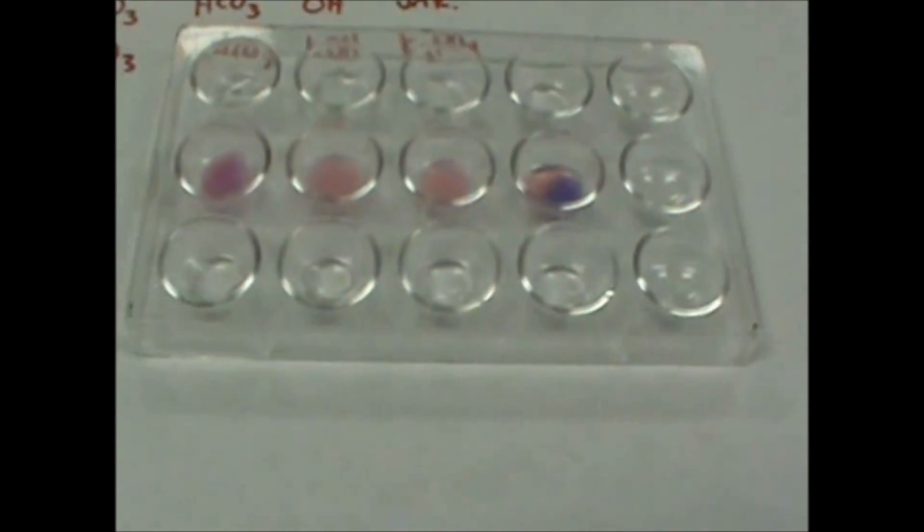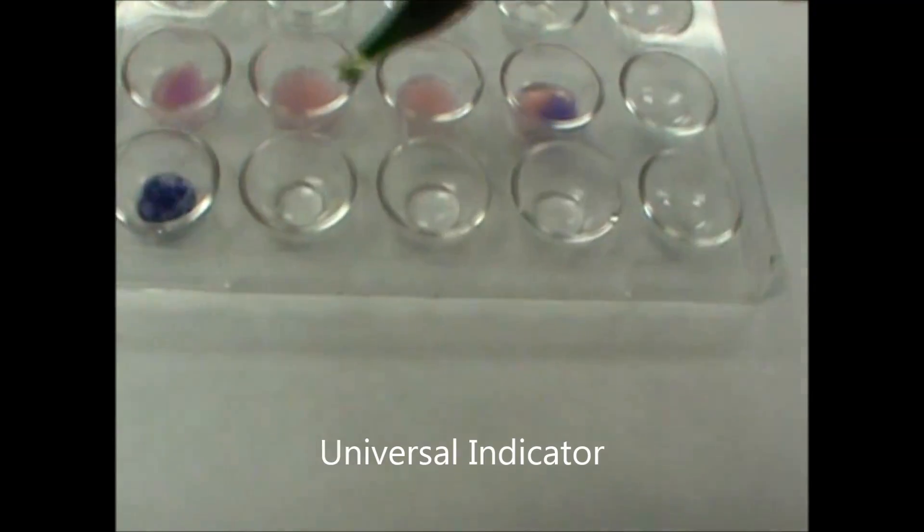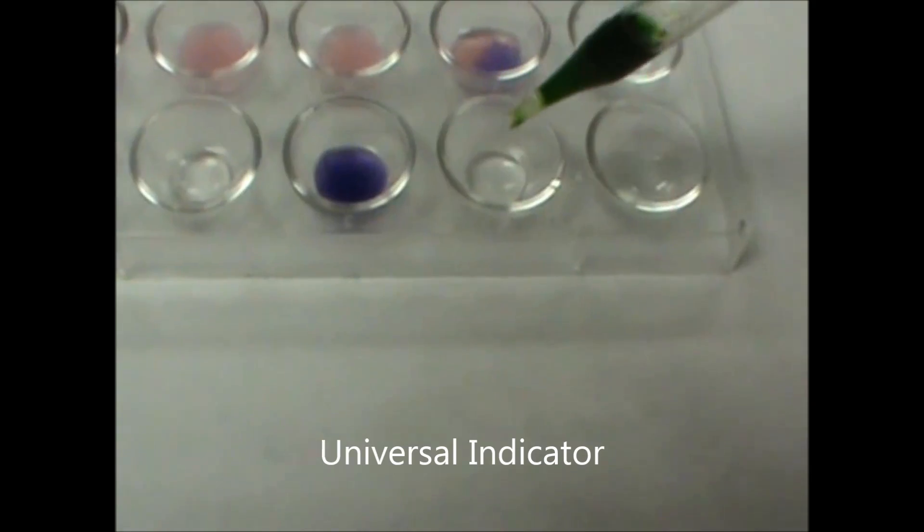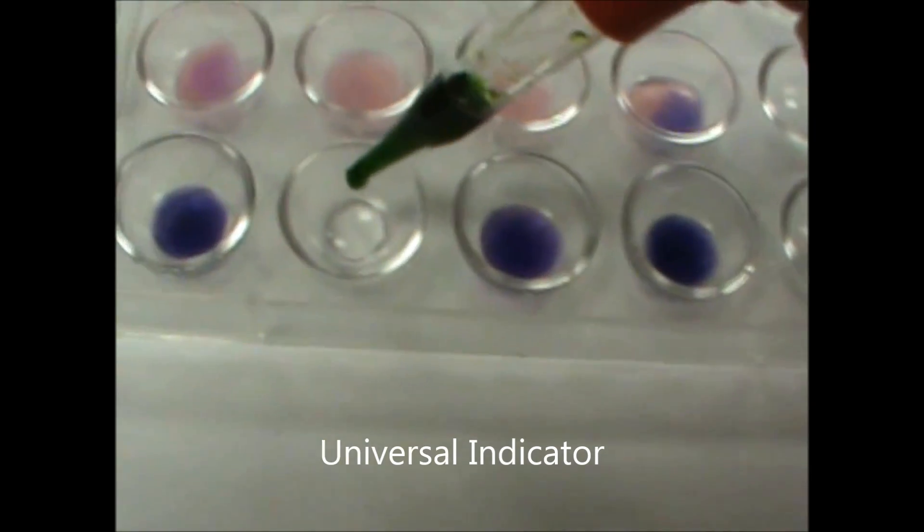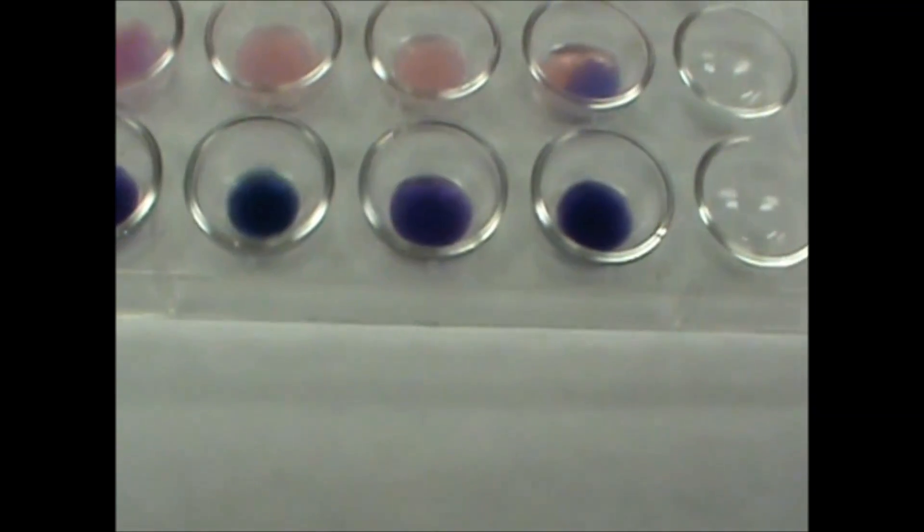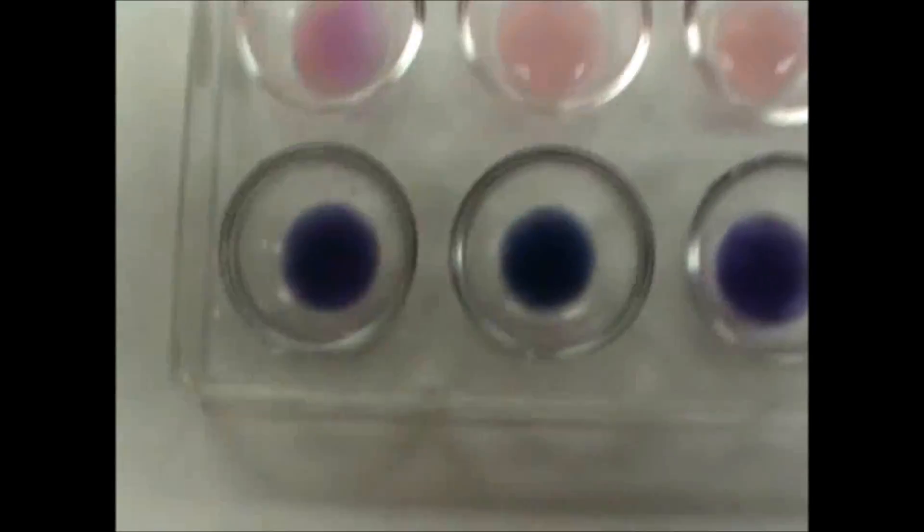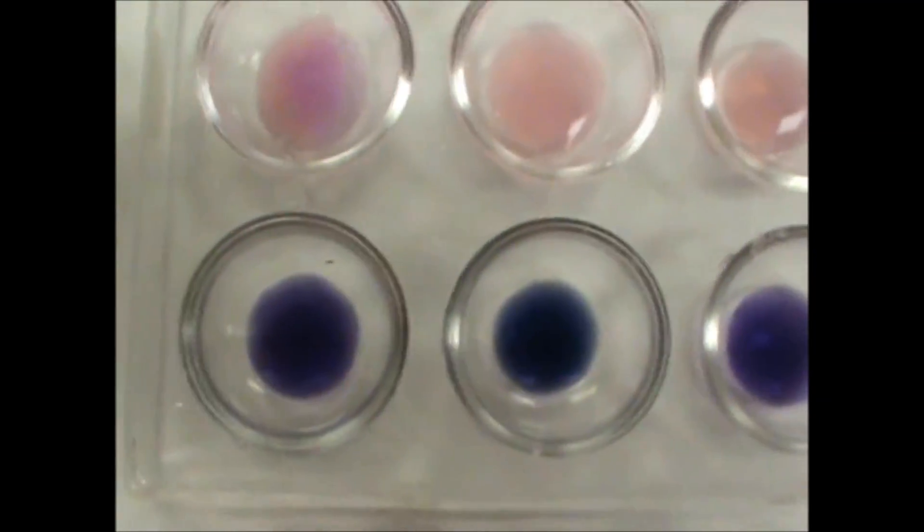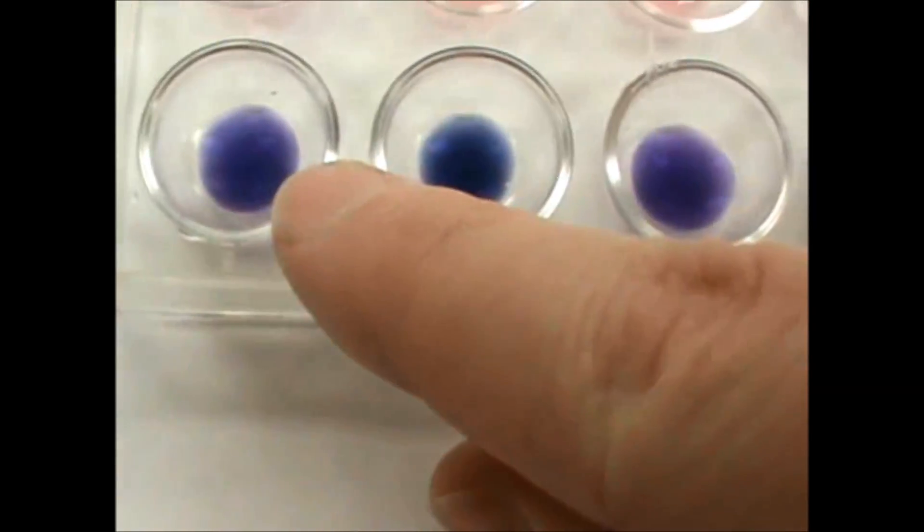After that you can add universal indicator. Now the bases will turn purple, but there's a chance that sometimes the bicarbonate will turn more blue than purple. So it's hard to see, but this is more of a bluish hue to this one than there is to this one which is purple.